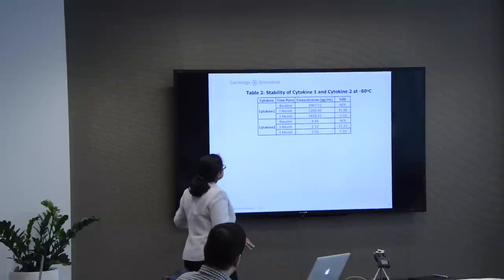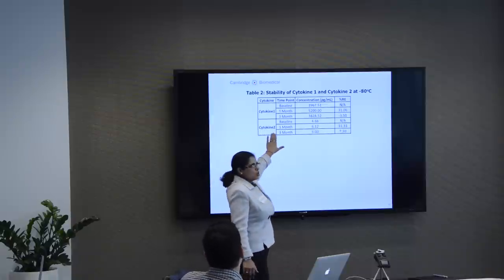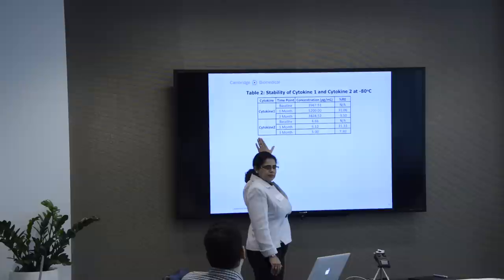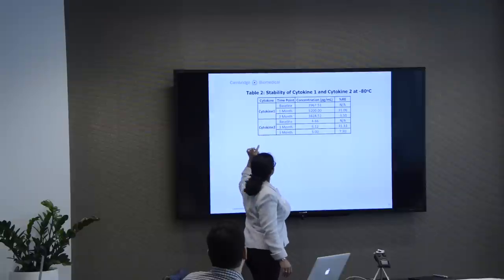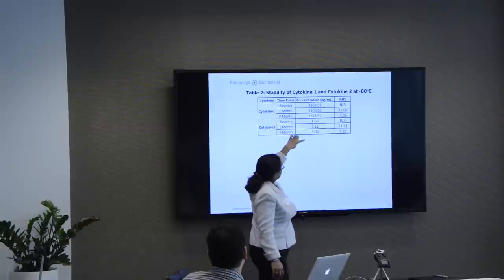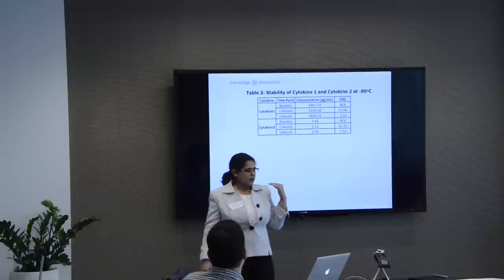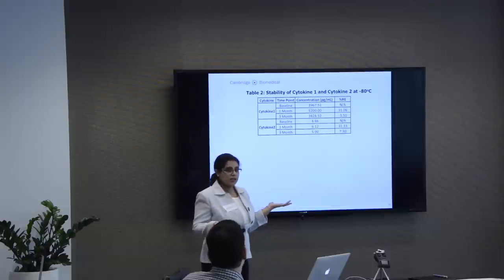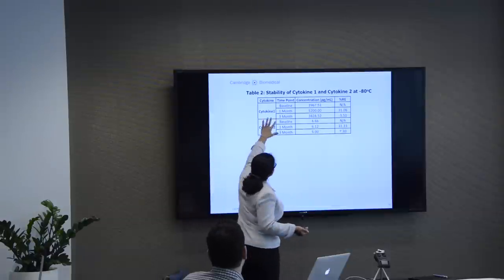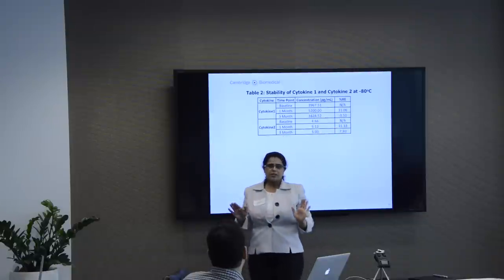As an example, this table shows stability of cytokine 1 and 2, stored at minus 80 degrees Celsius. No freeze-thaw cycle here. So that's the baseline, 1 month, cytokine 1 and 2. The relative error is 31%, well outside the recommended relative error range described by FDA. But look what happens at 3 months, they're back. They're back to that acceptance criteria.